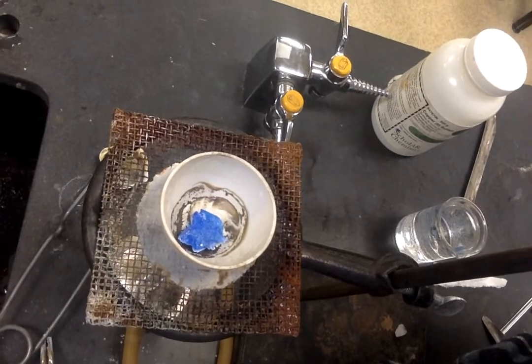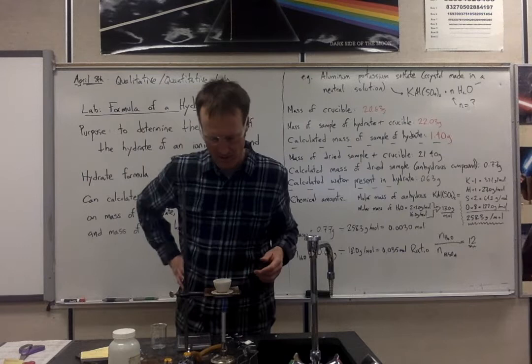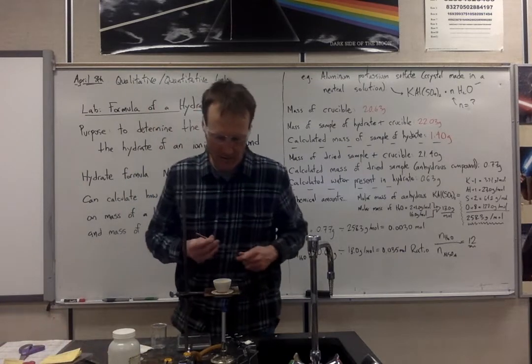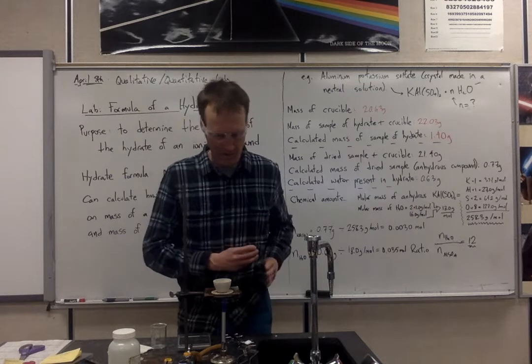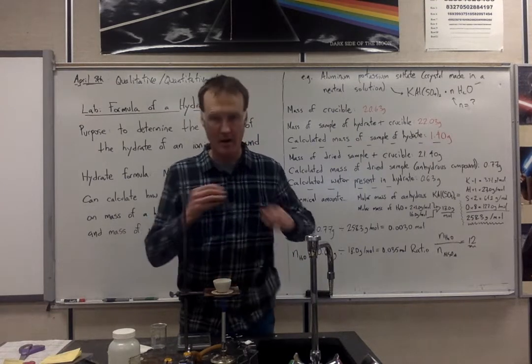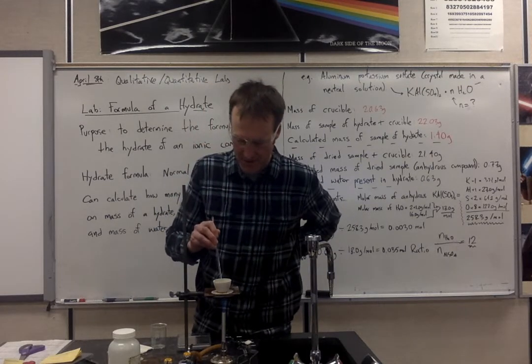You can hear that hissing sound. That hissing sound is the boiling of water inside the crystal. Very soon that's going to start to break the crystal apart. I'm going to use this stirring rod to try and make the process happen a little faster.